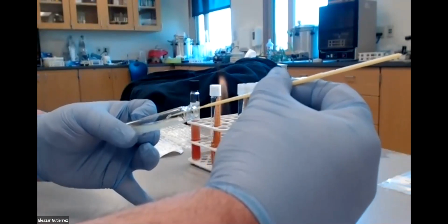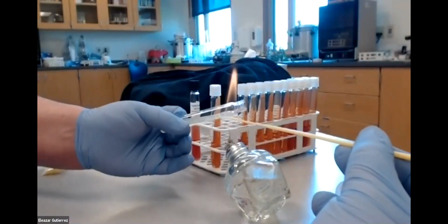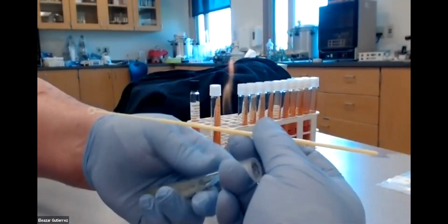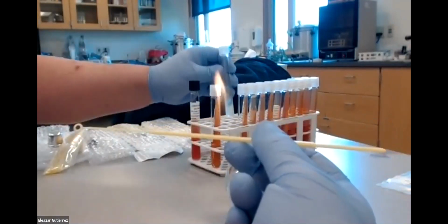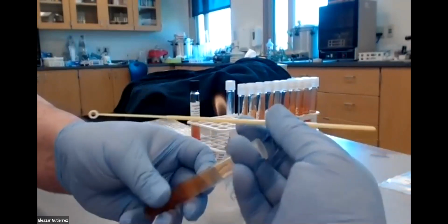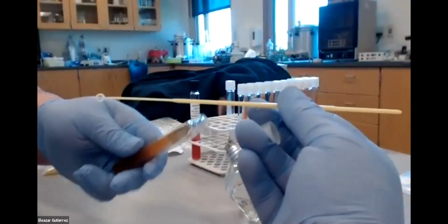We're going to take a small inoculum out of there. There it is. I'm going to flame my tube. 1, 2, 3. And I'm going to grab the exact same tube a second time. Okay, there's my tube a second time. I'm going to take the cap off. I'm going to flame it.